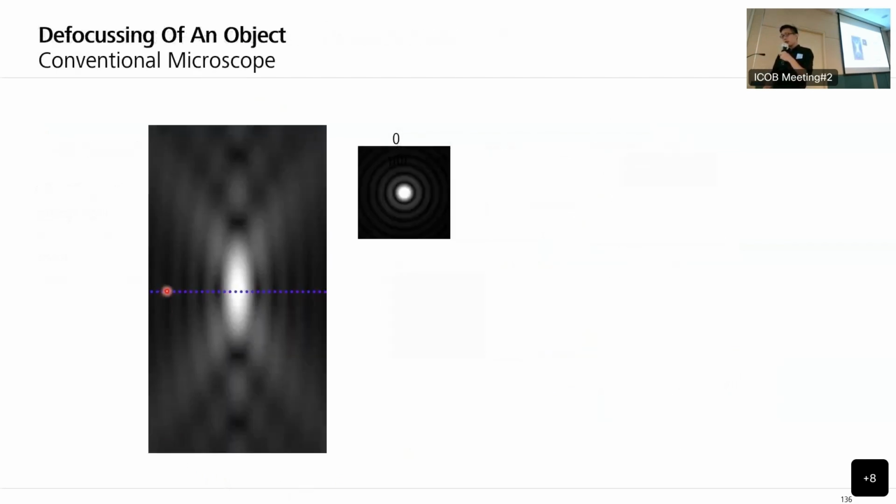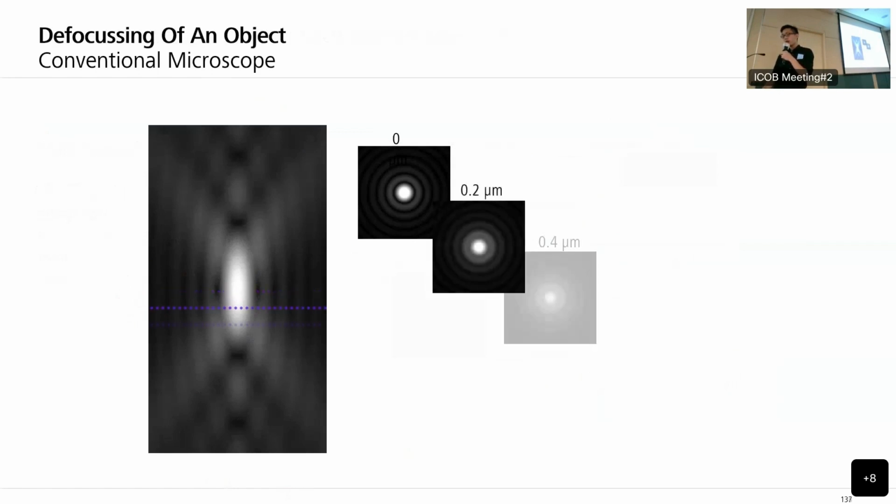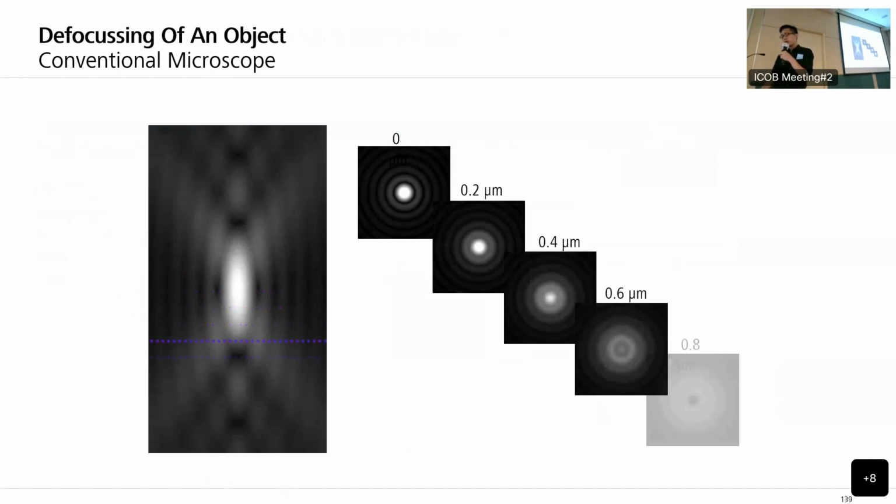And let's just dissect the signals by using optical sectioning. For example, the zero position is in the middle of this image. Then we go to other planes and take serial images. Here we take 5. Then we collect some out of focus structures, listed here.